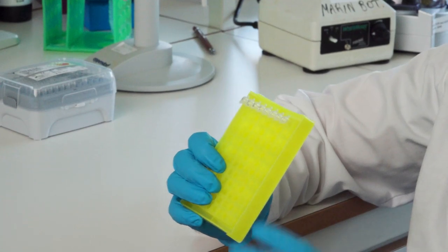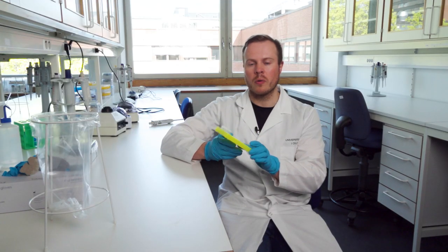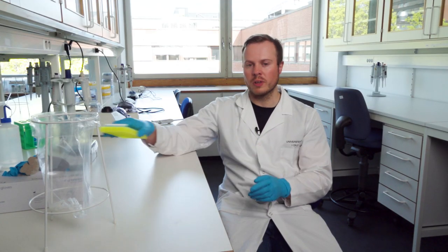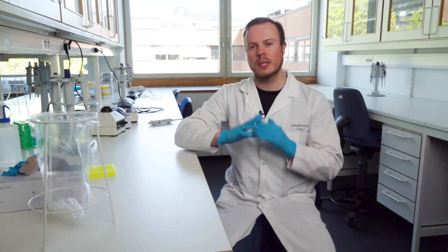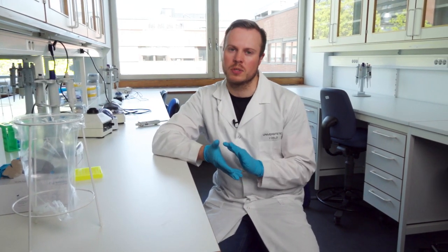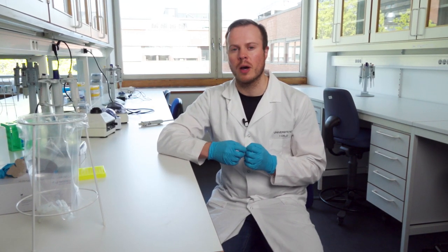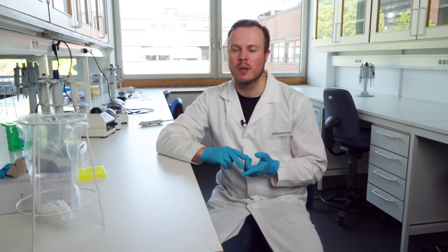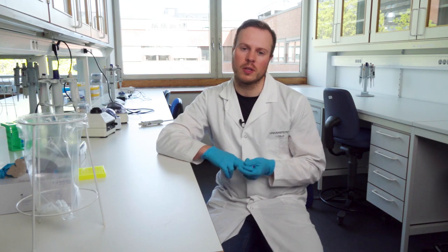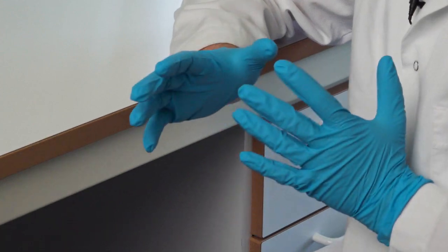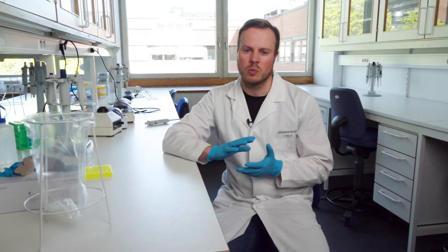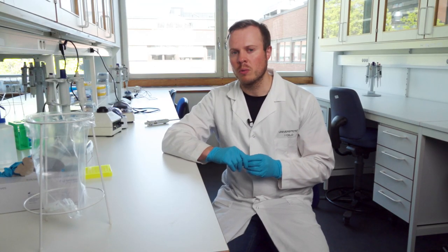And the quantification is one of the last key steps we need to perform because this is where we find out the quality of DNA and amount of DNA as well. And here you have a little bit of different options to how you do the quantification.